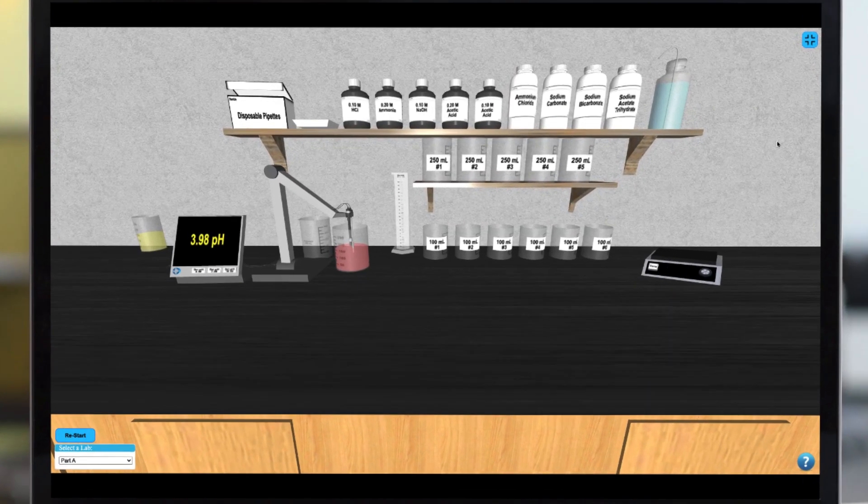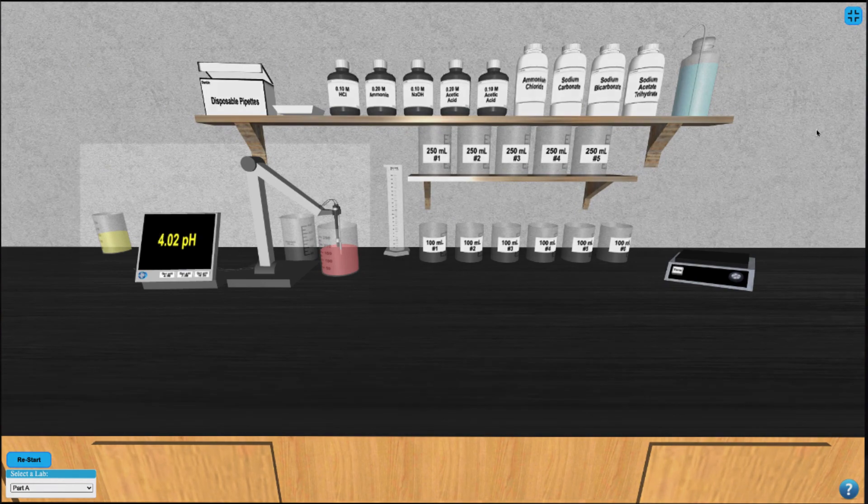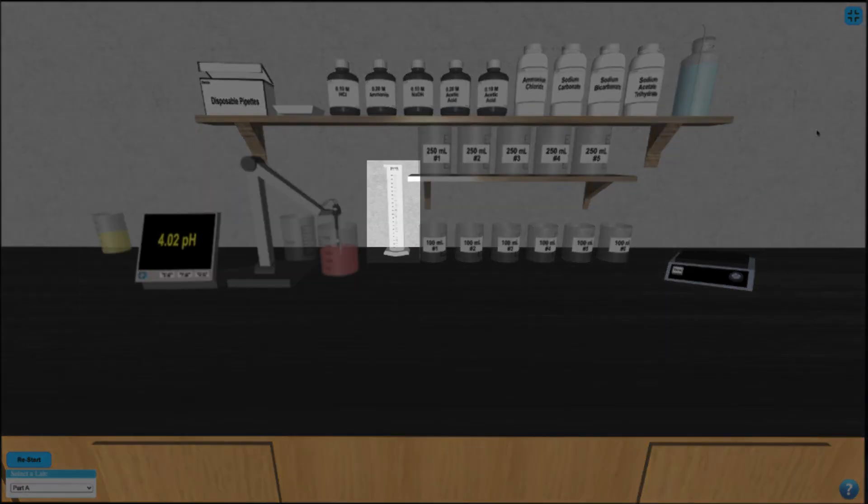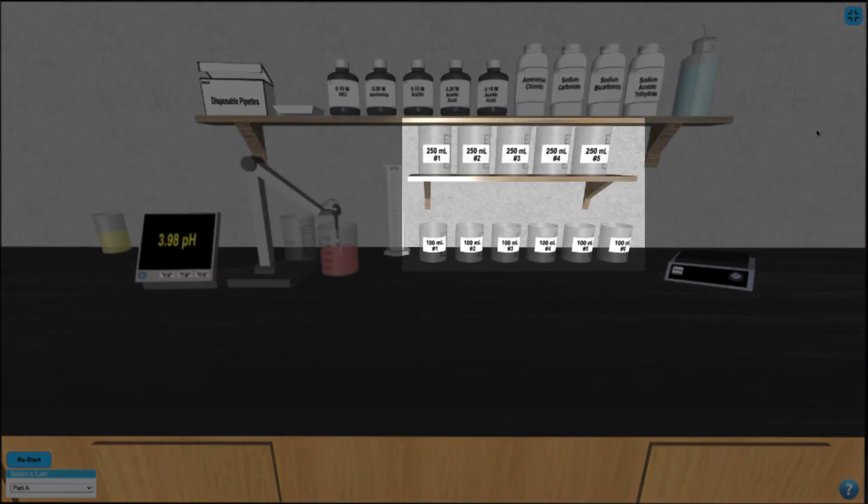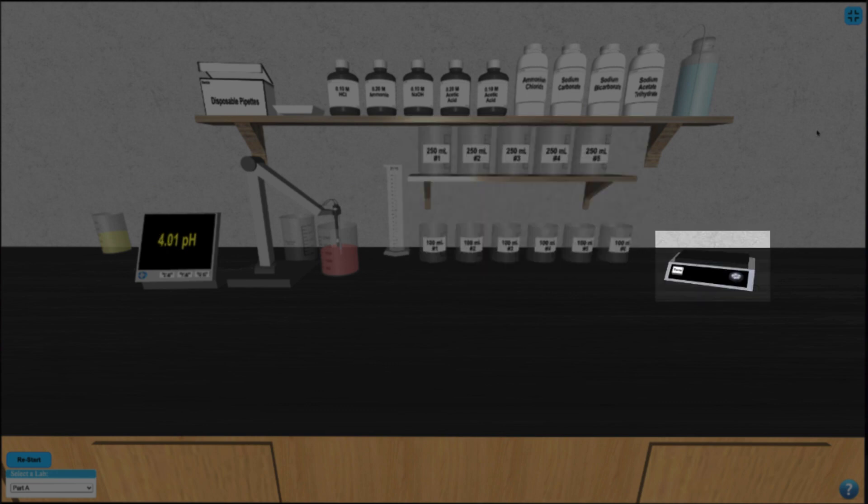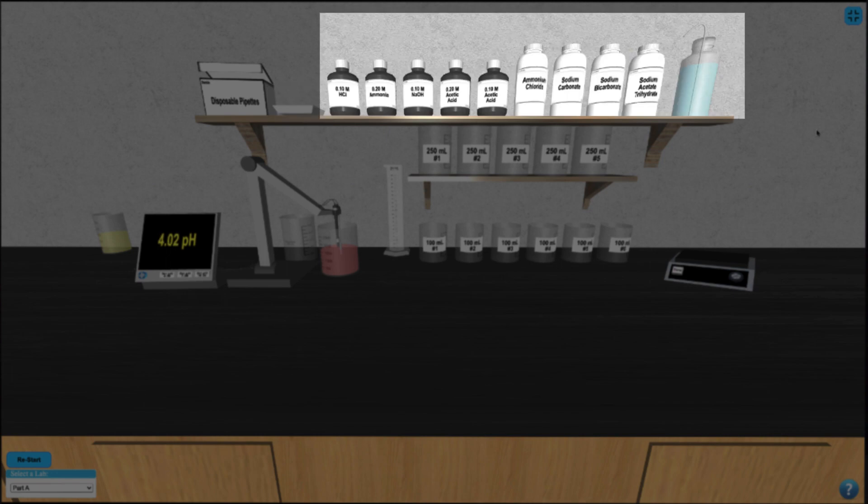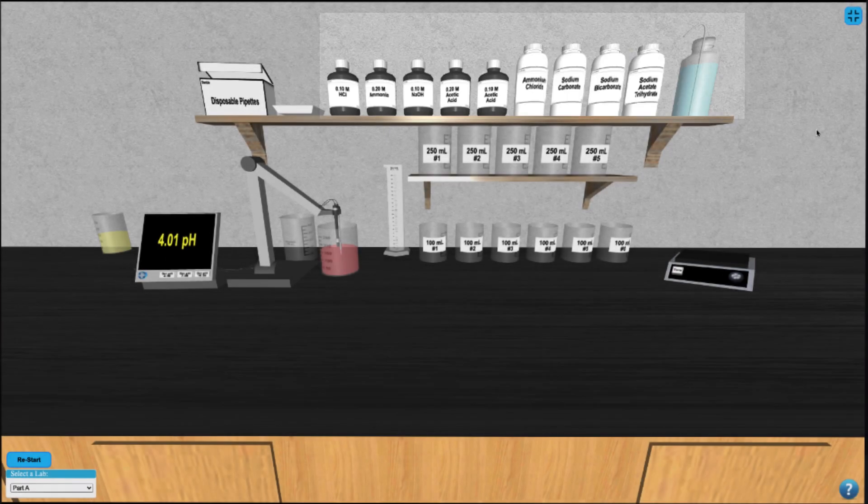In this simulation, we have a pH electrode and calibration solutions, a graduated cylinder, several beakers to prepare solutions in, a balance, disposable pipettes, weighing boats, and several samples to work with.